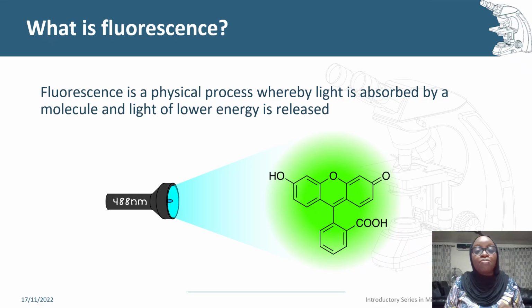A fluorophore is a chemical compound that emits light upon excitation. It typically contains several aromatic groups or cyclic molecules with pi bonds. In this case, the chemical structure is fluorescein, an important compound in the history of fluorescence and in microscopy today.